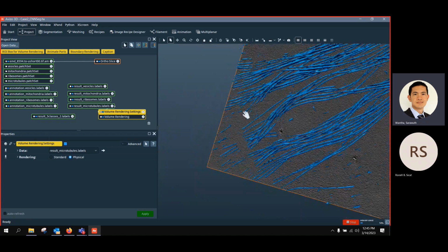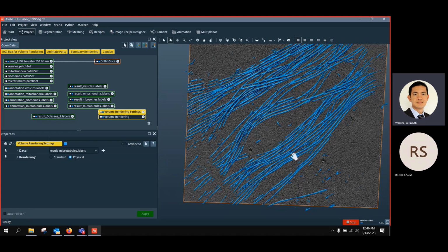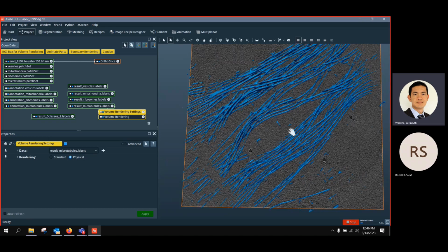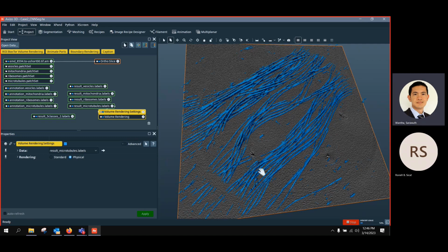Or even here, you don't have to use the full volume. You can maybe extract only the good part and use it as the input ground truth image. Yeah, but still it's 2D. Yeah. Do you remember the Snickers bar, where we did the chocolate from one side and the chocolate from another side? Yeah. And then we interpolated, and this is how we segmented three-dimensionally. Exactly. But it was not precise. Not precise enough. For example, I want to make it precise to train my model. Yeah. Because the precision here is crucial.